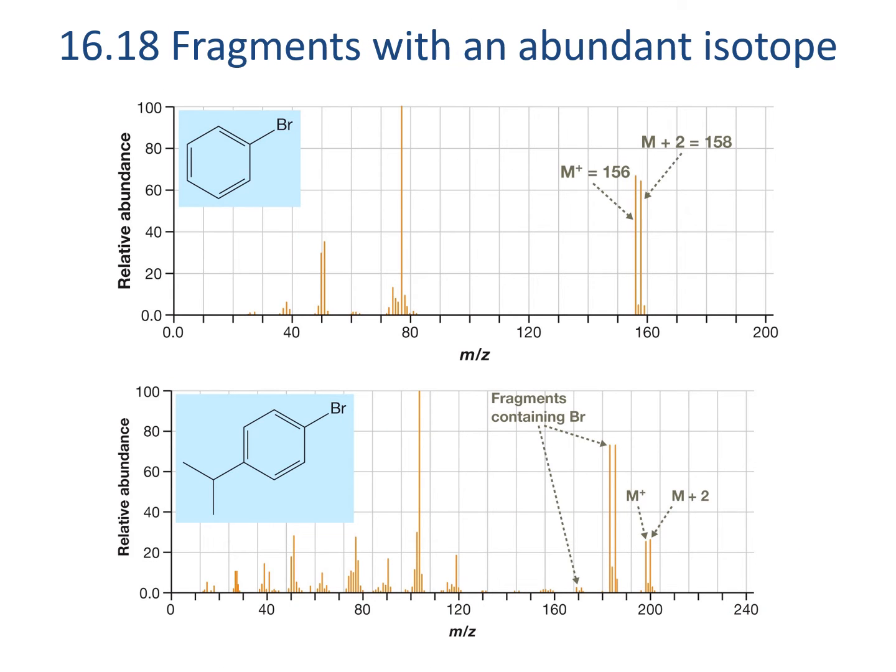We can see these mass plus 2 peaks for the molecule itself, and that's relatively straightforward. We can find the mass plus peak by looking for the largest cluster of ions, and if we have one that's at 2 higher than another one that's about the same ratio, that gives us a really good indication that we have a halogen. And if they're, again, equal, we'd say that this is probably going to have bromine in it. And we see the mass and mass plus 2 are only 2 apart, and they have about equal heights.